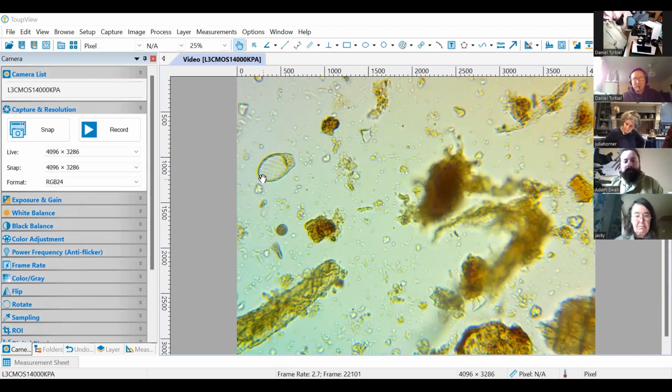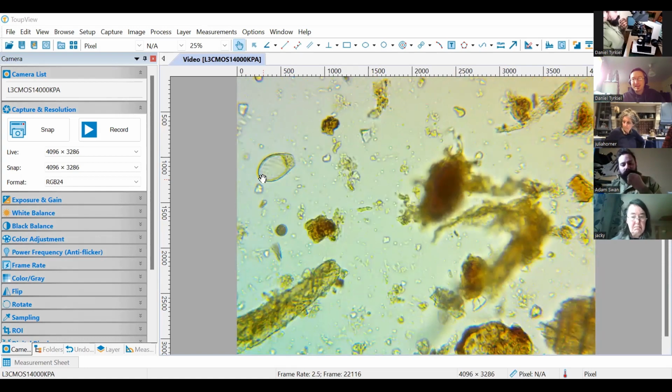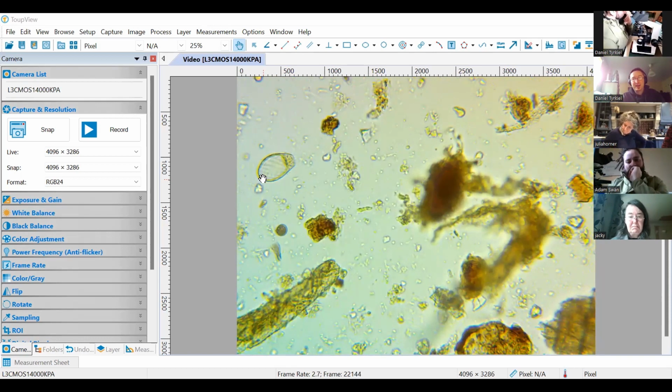So this is what we would call a testate amoeba. And in aerobic compost, you mainly see these guys. So there are naked amoebae, and then there are testate amoebae. If compost is aerobic and not too wet, you're going to see these guys, representing, as Adam called them, amoeboids. And in more mature compost, some other shapes of these testate amoebae appear as well.